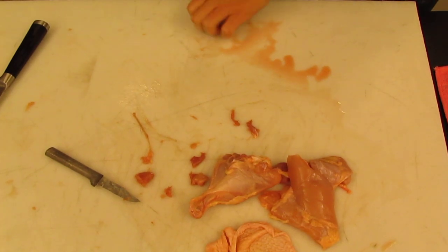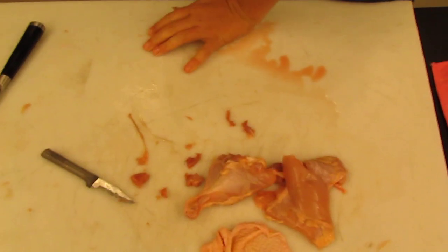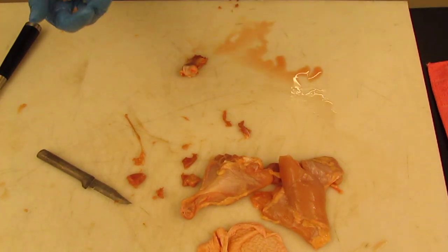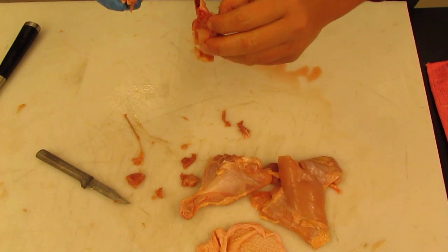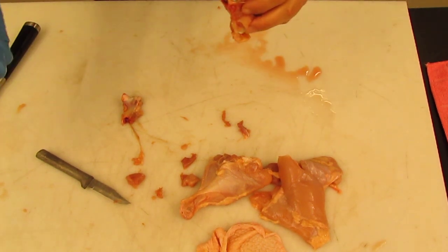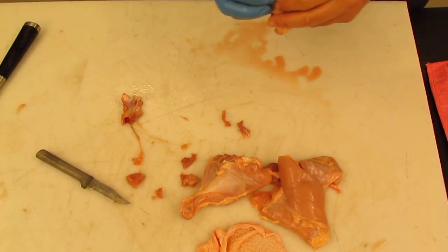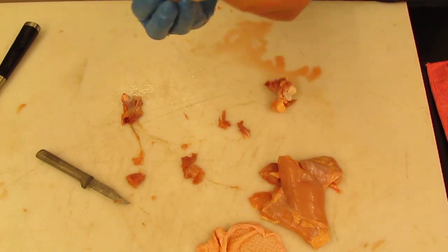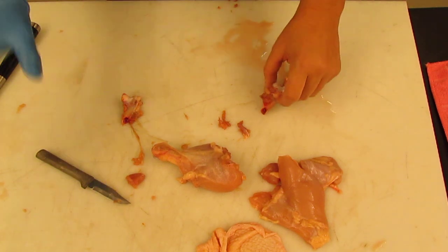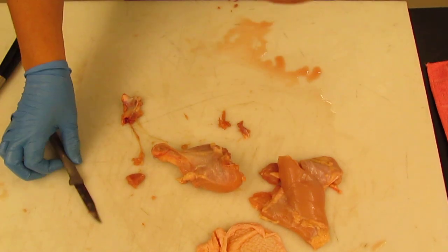But of course it's very slimy and a little hard, and it makes an awful noise. I apologize to one and all. But breaking the femur, if you have kitchen shears, that might work as well. You could also try to break the tibia inside the drumstick instead. Just want you to see inside the bone.